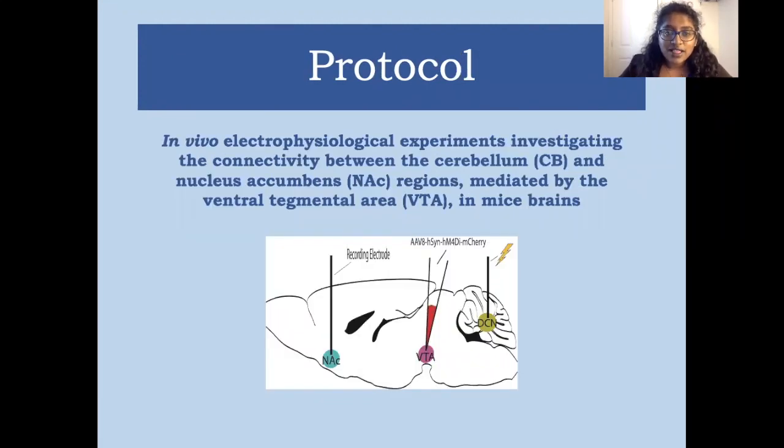Our protocol was developed in the context of a greater in vivo electrophysiological experiment investigating the connection between the cerebellum and the nucleus accumbens regions in mice brains and how this connection has been mediated by the ventral tegmental area, or the VTA. My co-author, Alexa D'Ambra, who is a graduate student in the lab, has been investigating this connection by first lowering a stimulating electrode into the cerebellum so it can stimulate the deep cerebellar nuclei there, and then lowering a recording electrode into the nucleus accumbens.